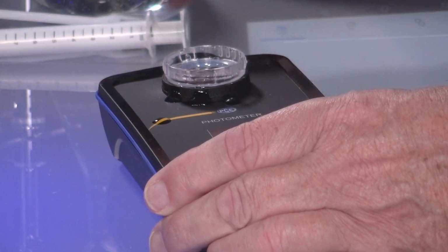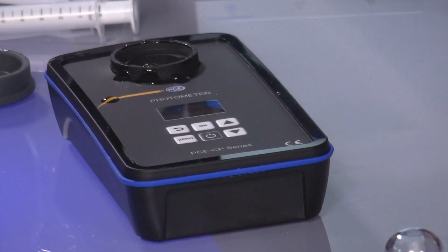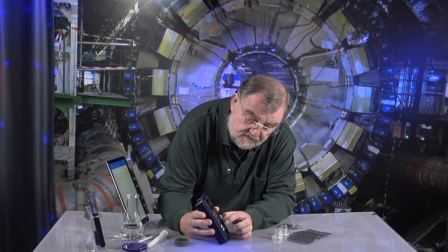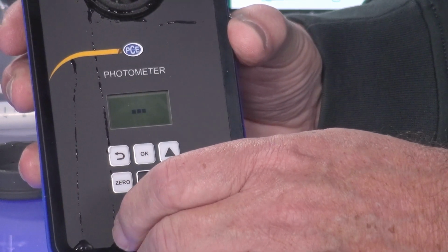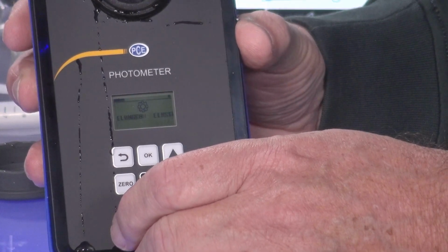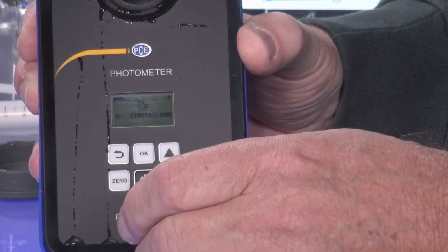So the measurement is finished. I can't show you it without it spilling out. I'll just open it, take this out, I'll tip it into here. It won't explode straight away. So, and then we can see here on the display, oh, it is pretty small. Now it shows naught again. Then I have different menu points which I can choose. It is pretty hard to get it into the camera, so now you can see it.